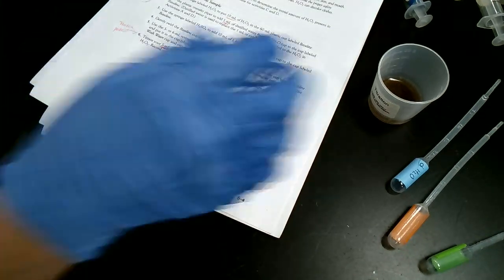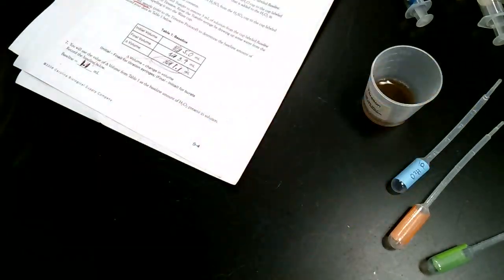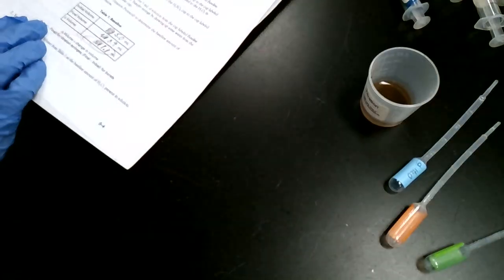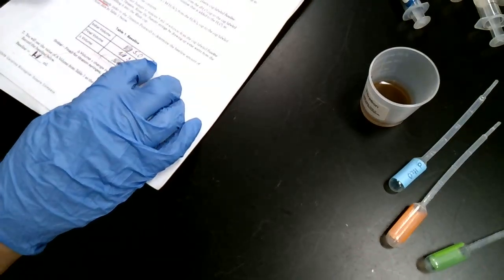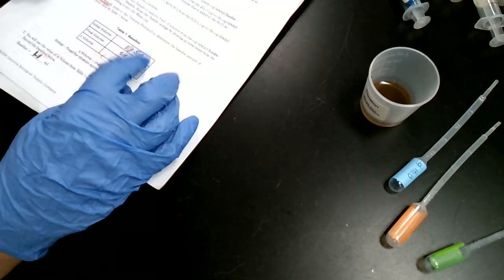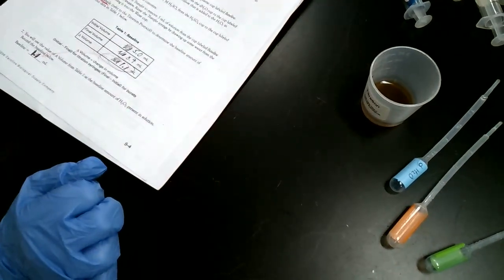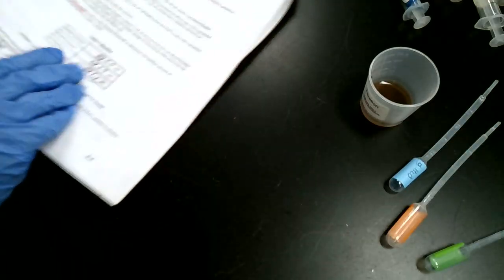Okay, that's pretty interesting there. Okay, usually I see it as a little bit more. So we're going to go with this and see what happens. Okay, so I started at 5, went to 3.9. That was a 1.1 change, right? I did do my math correctly there. And that should be our baseline for our next things.